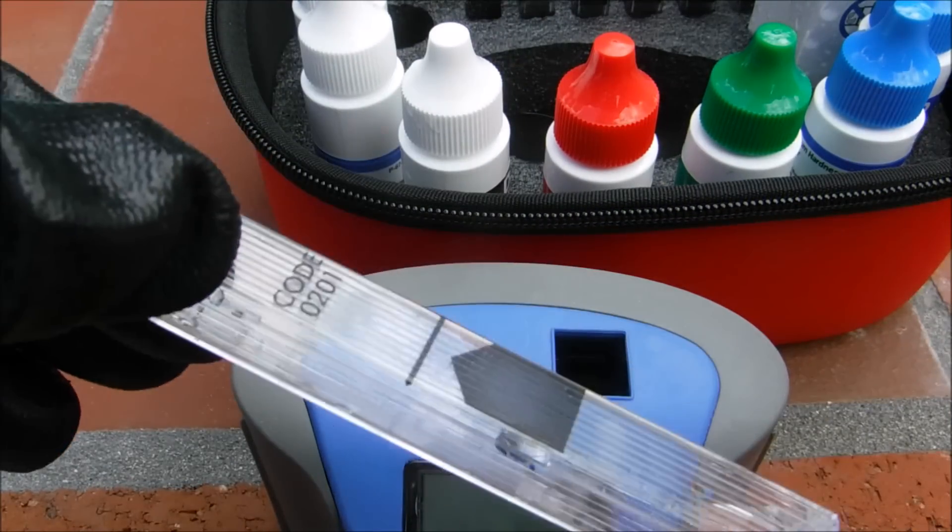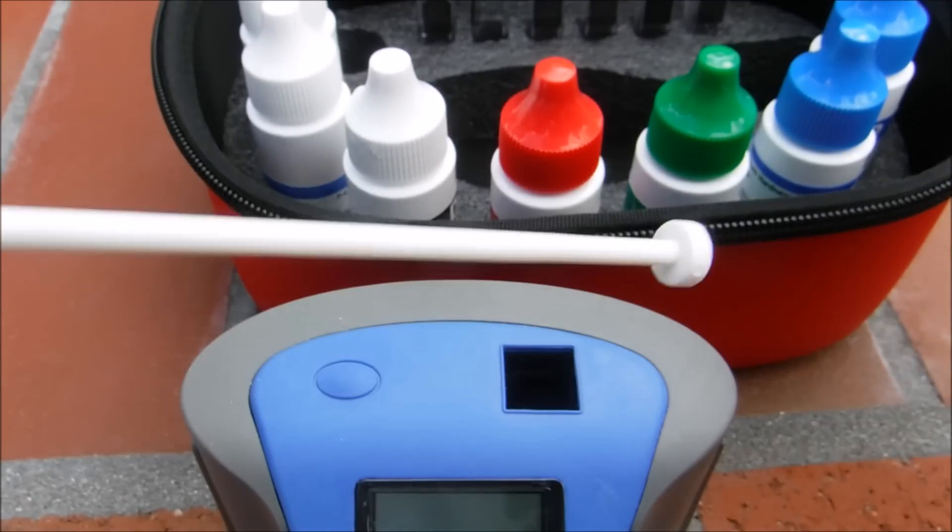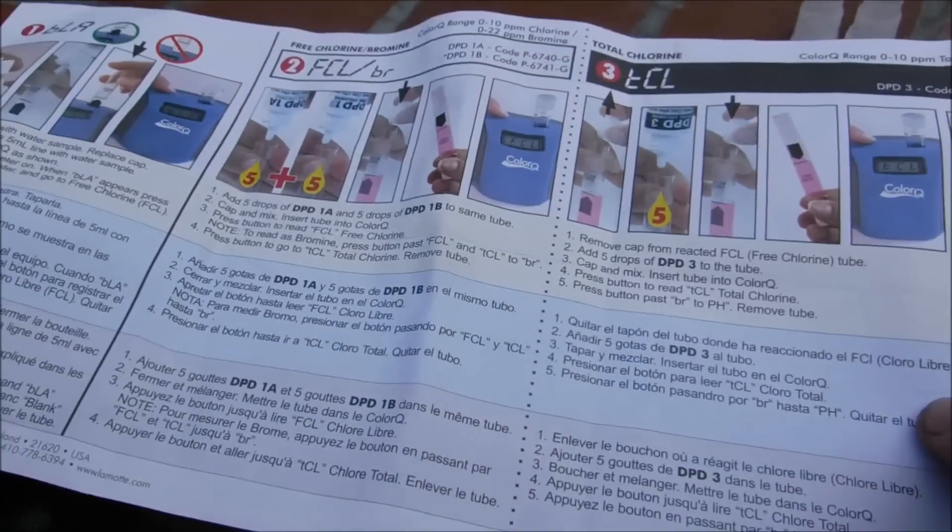There's also a cleaning tool for the test tubes. The cyanuric acid is in pill form, and it comes with a crusher so you can crush the tablet. There's also a nice color instruction booklet.